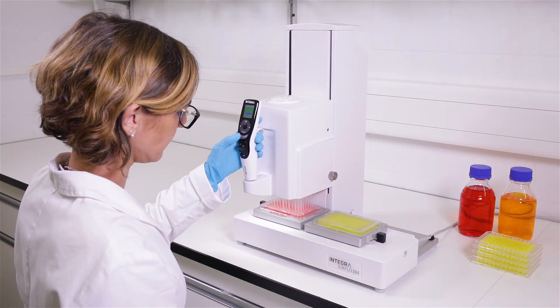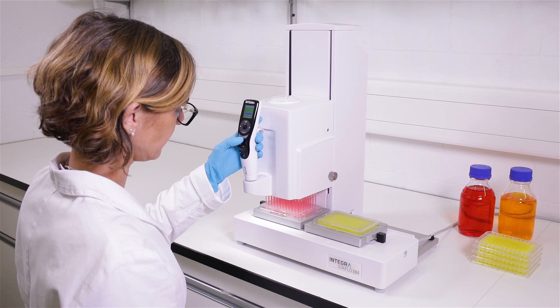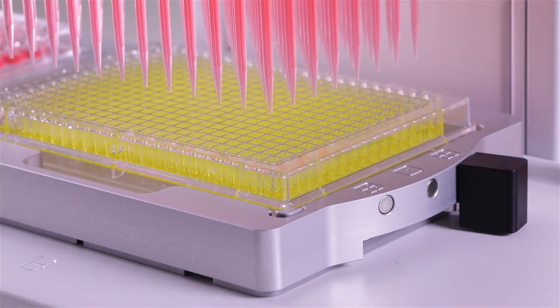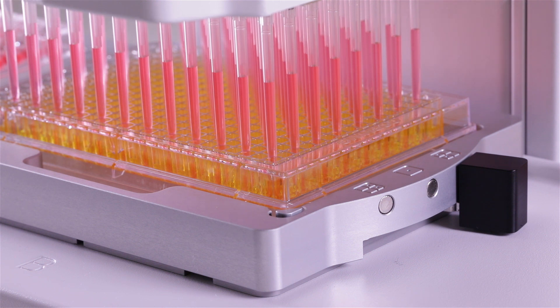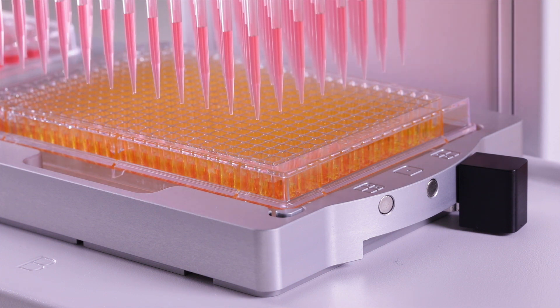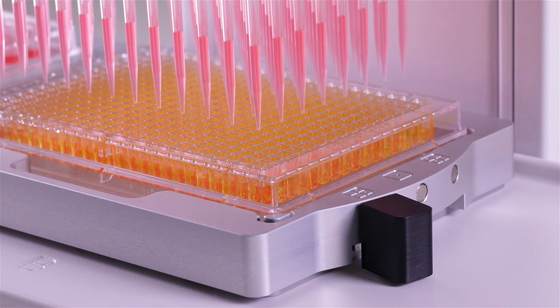Reformatting a 96-well plate into a 384-well plate is incredibly easy using a 96-channel head. Simply move the lever to the back in order to access the wells in the front of the plate, then shift the lever to the front to access the wells in the back.